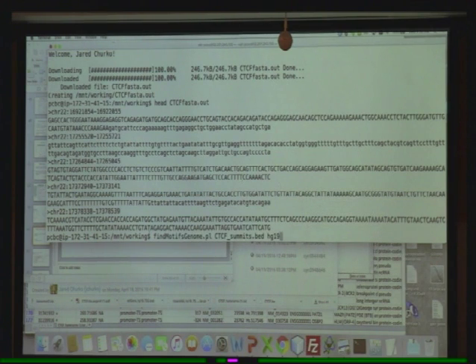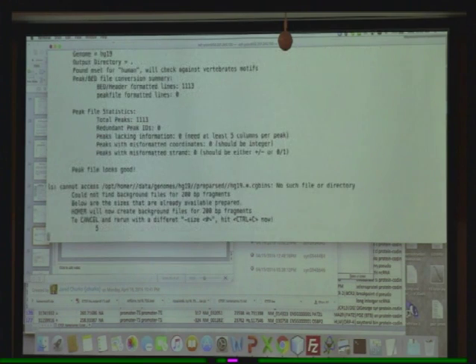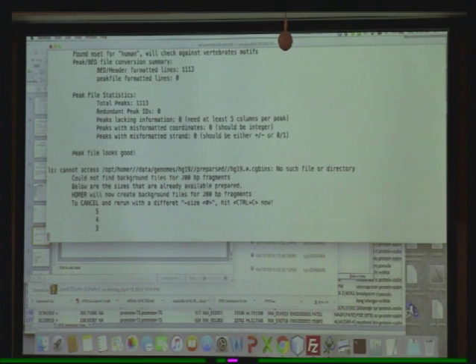Paste. So we're going to go find motifs, genome, and make sure, again, tab complete, and you have to capitalize the M and the G, .pl, space, ctcf summits.bed, hg19, space, and then you put the output directory. Let's say, maybe it'll work right within this. No. So make, what's that? Dot. Okay, so it's running.